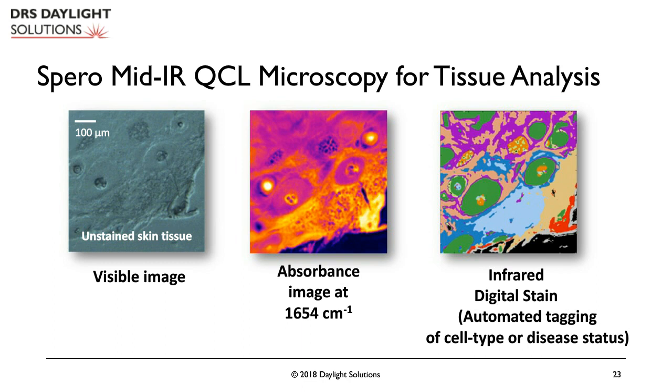The image on the right is what we refer to as a digitally stained image. And you can see the label-free image segmentation. This uses the full spectral data cube to create this. And this segmentation is known as clustering, where we separate single pixel spectra into a specified number of classes based on their profiles and properties. So let's take a closer look at this image and the clusters.